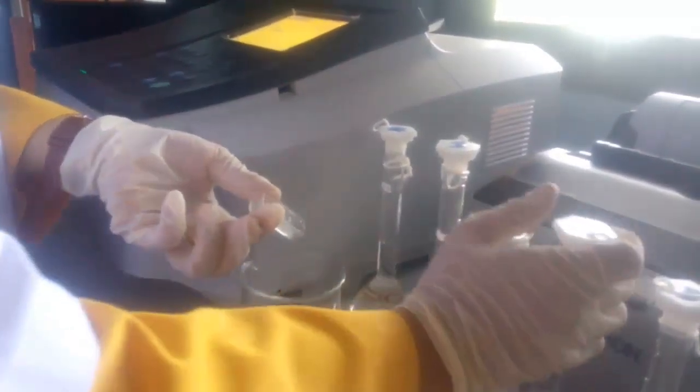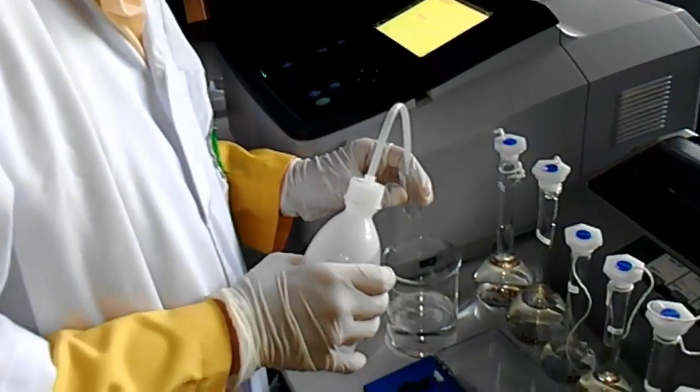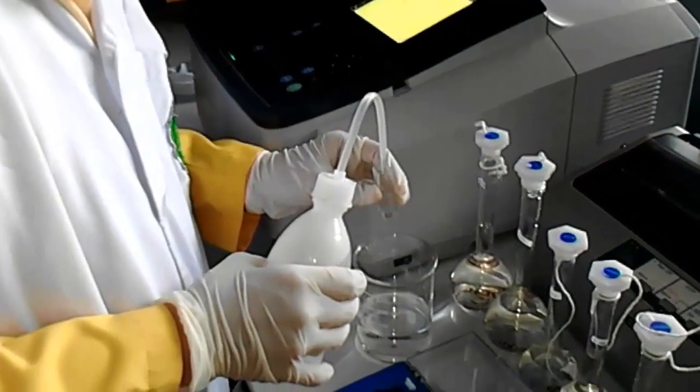Then wash off the cuvette with aquadest.